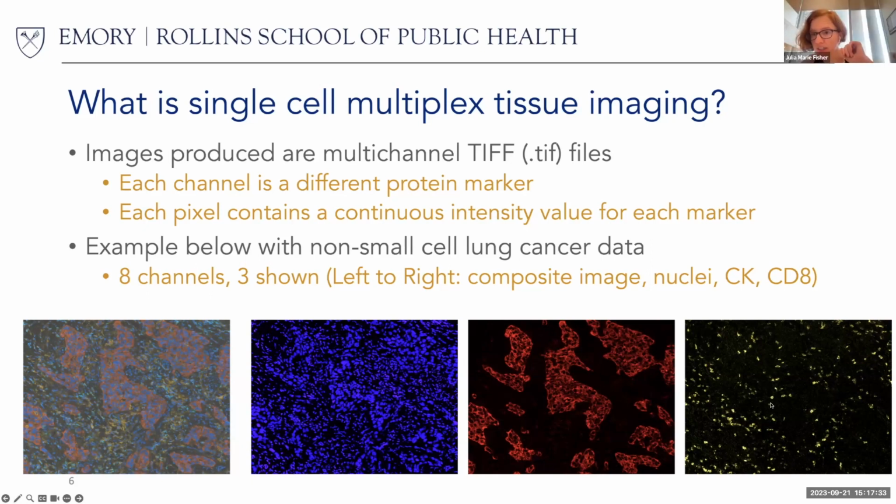It just looks like Miranda Lynch has a question. Yeah, I wasn't quite sure if we were supposed to interrupt with just kind of piping up, but when you're doing these sort of merges of the different modalities, do you have to do any re-registering of them, or are these essentially just snapshot after snapshot with no shifting of the spatial positioning of the things in the cell? No, that's a great question.